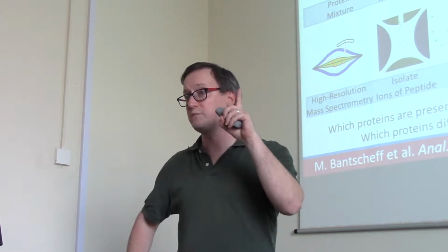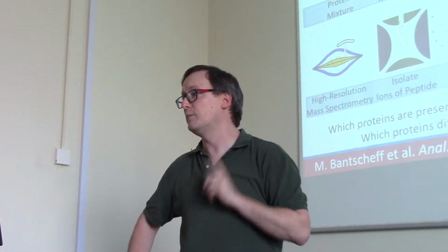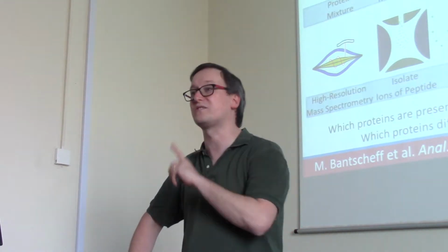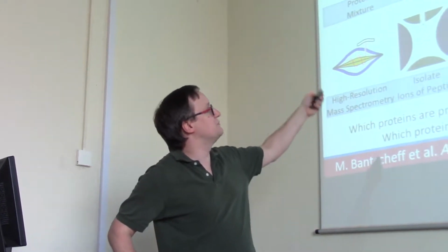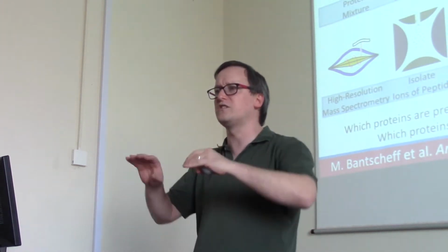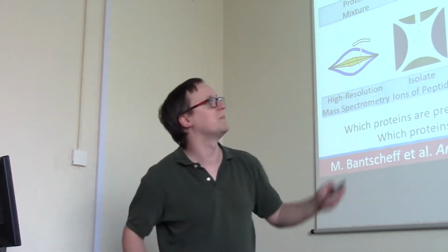This, by the way, is probably the number one thing missing in South African proteomics at this point. Mass spectrometry experiments are kind of expensive here, and as a result, almost no one uses fractionation in this city or in this country. So here we see that we now subdivide this mixture of 100,000 peptides into fractions. And these fractions overlap a little bit with each other in which peptides they contain, but not tremendously.